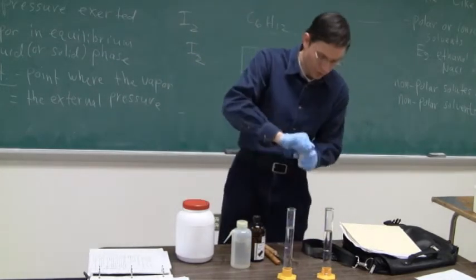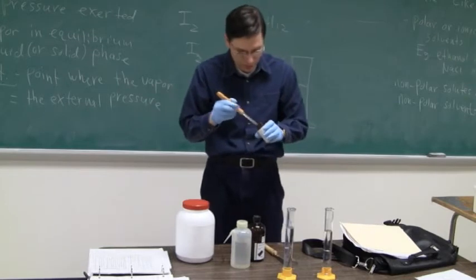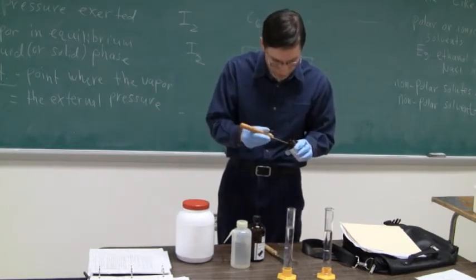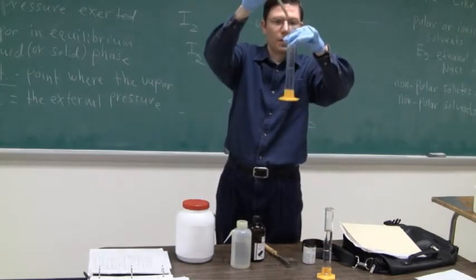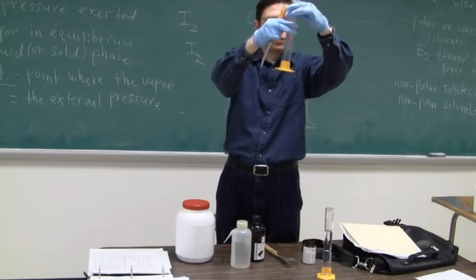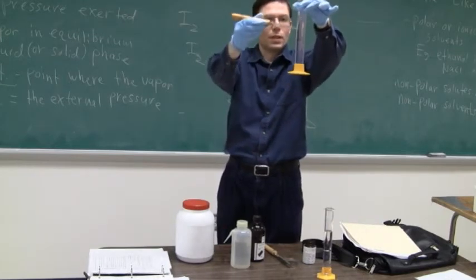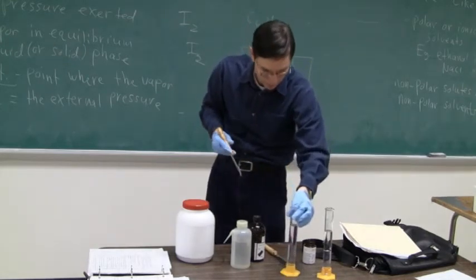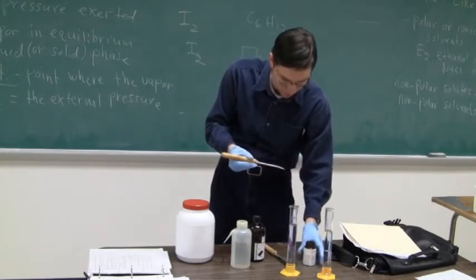Now, what might happen is, well, we'll see what happens. I'm just going to get a few crystals here. All right, so, I'm going to add it. Now, a little bit is going to fall down through. But, we can see you've got this kind of purplish looking layer. I can add a little bit more. If I actually mix this, it would work a little bit better.